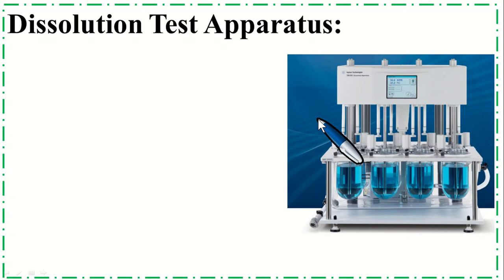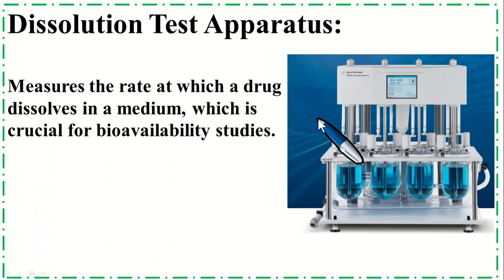Dissolution test apparatus is the most important analytical apparatus, which is used to measure the rate at which a drug dissolves in medium, which is crucial for bioavailability studies.